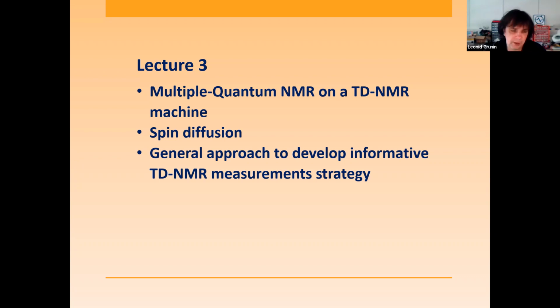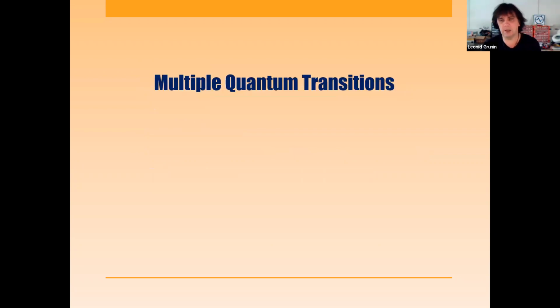And then briefly we'll discuss what you need to do if you have the time and the machine and your samples, and what experiments you can run. So in the beginning of our lecture, in a few minutes after my introduction, you will see the experiments that Esma is going to demonstrate to all of us. Okay, let's then start with multiple quantum transitions.